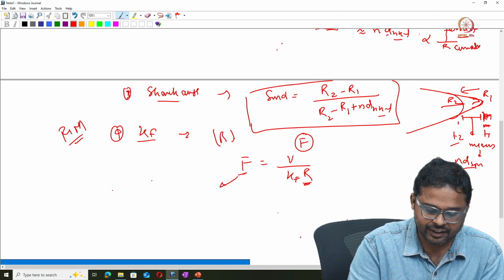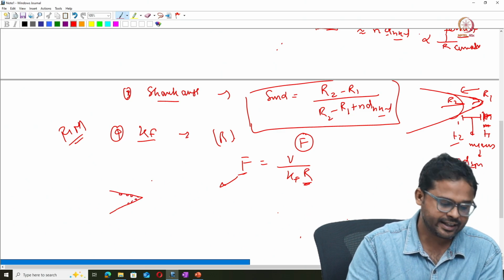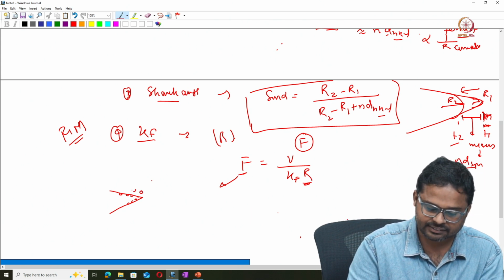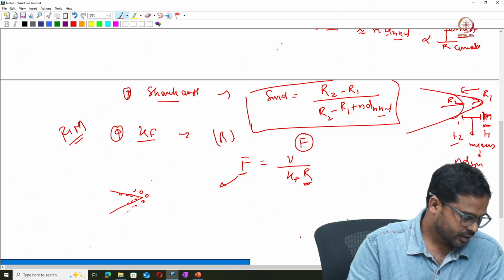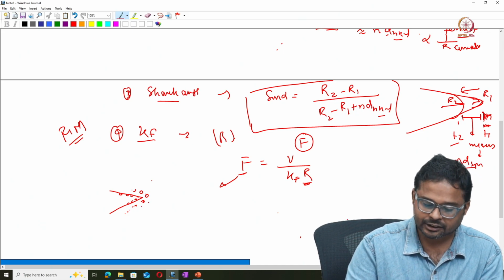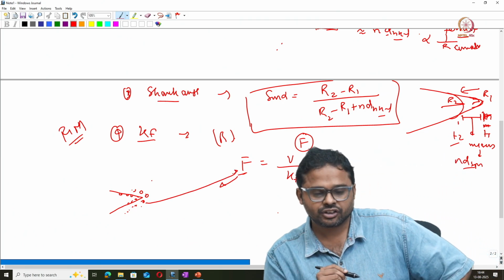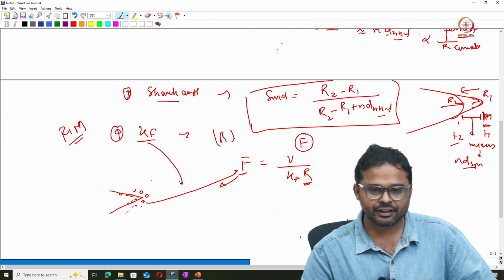So whatever field is required to field evaporate the atoms from the tip surface varies, and due to the presence of this imaging gas, the precise determination of the field is not straightforward. So determination of kf by FIM is a little bit difficult.